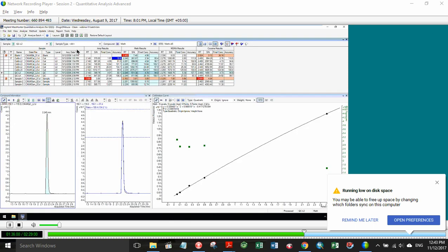Okay, we can have user-defined columns, and then we can implement those into an outlier possibility. It's user-defined. Here's the variable. What do I want to do with it? How can I handle it? I may need to put in a custom calculation to take into account that user-defined field. Or a user-defined field can be just text information, like first extract, second extract, or whatever the case may be. So we have that information readily available to us in the batch table to know what we're looking at.